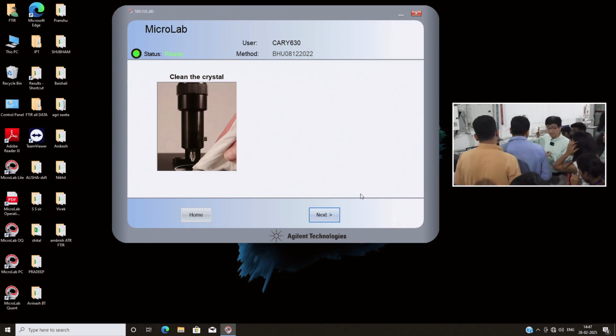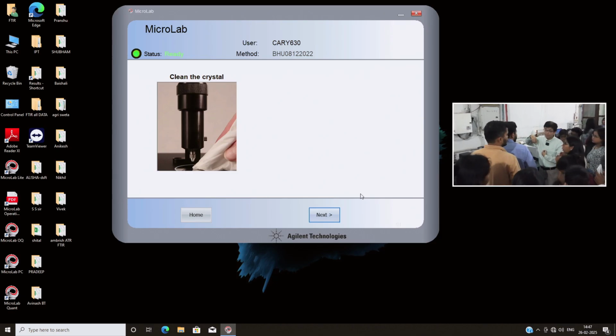I0 is a measurement of air. That was 0. The first time, that is I0, we did not put the sample. We already put the sample and then took the I, so that is why there is no spectra of water. Next time we take the spectra I0 of air, then we take the water.